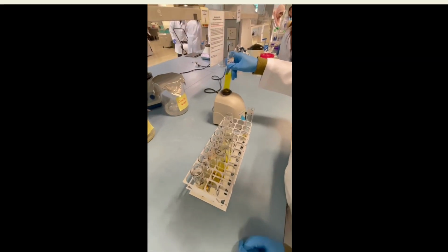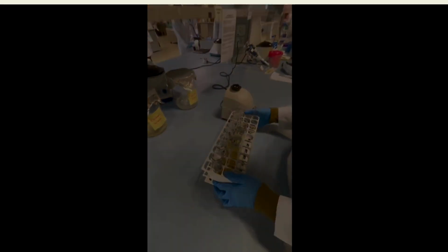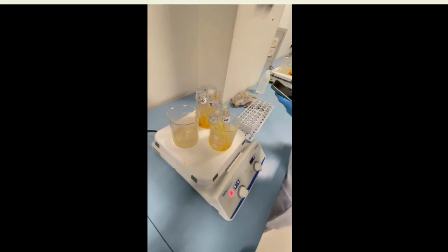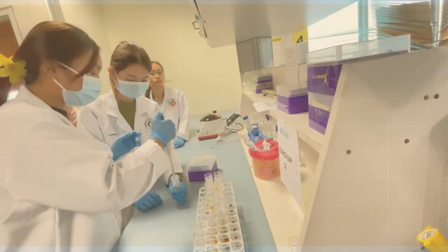Next, the test tubes are shaken well and boiled for 5 to 7 minutes. Then, cool them down to room temperature.